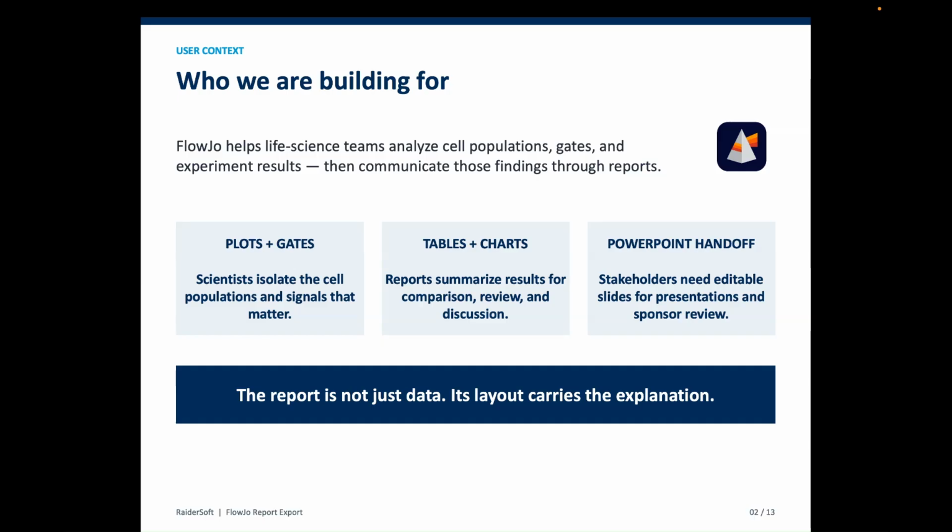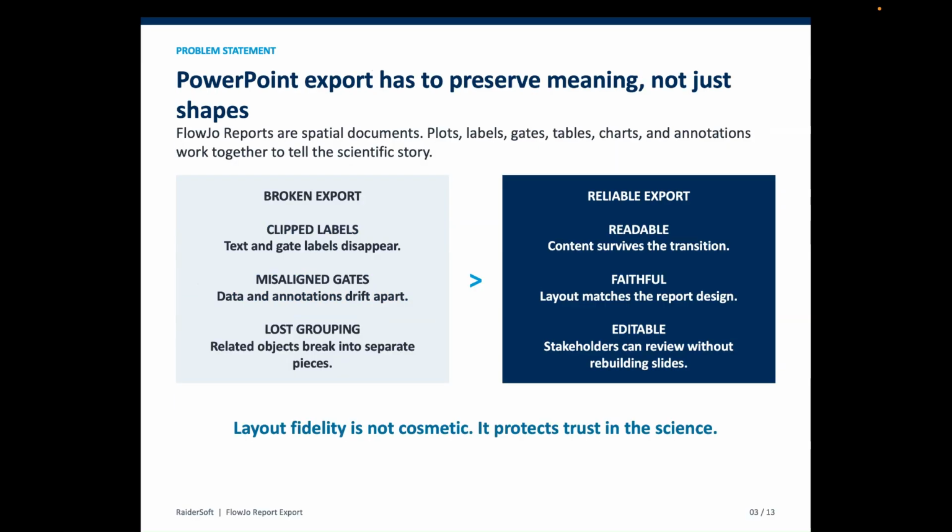Because of that, the report isn't just a collection of data. The layout itself helps explain the scientific story. Our goal was to preserve both the information and the meaning behind that layout when exporting to PowerPoint. With those users in mind, we defined a set of project goals that guided the development of the exporter. Now we're going to go over the main problem we were trying to solve.